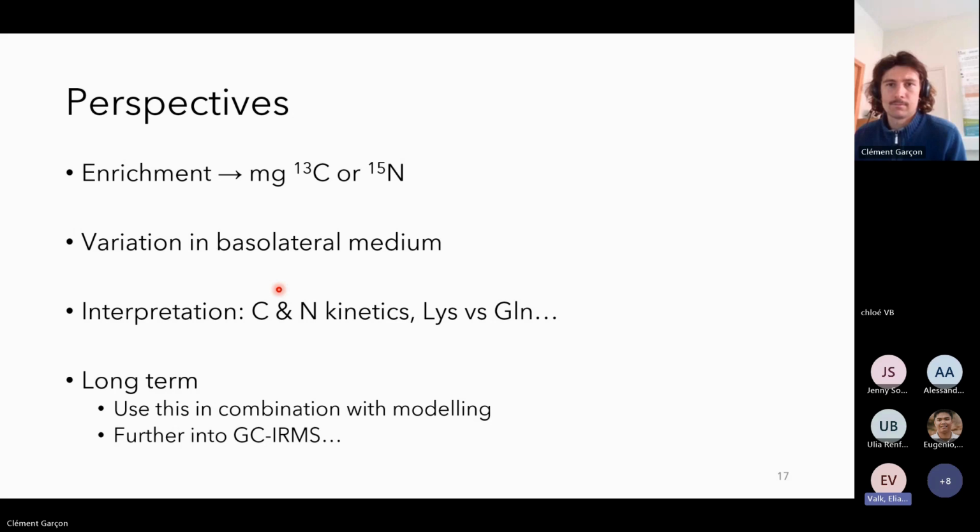Sorry, I had another question. You also mentioned the permeability. Did you use some sort of measurement during the transport studies to measure whether the integrity of your cell layer is fully intact? So whether there's already some passive permeability, with, for example, dextran?